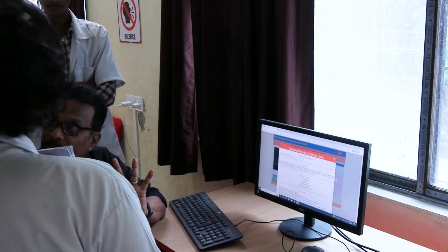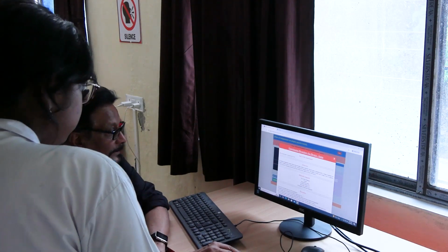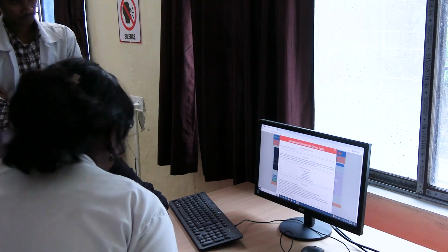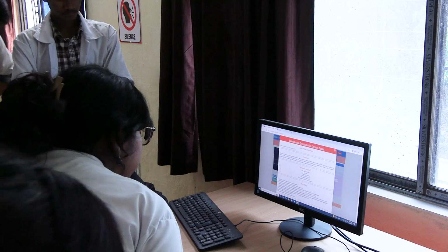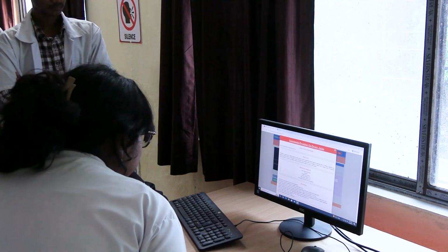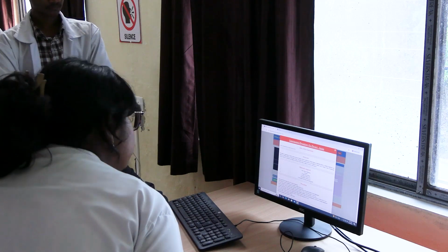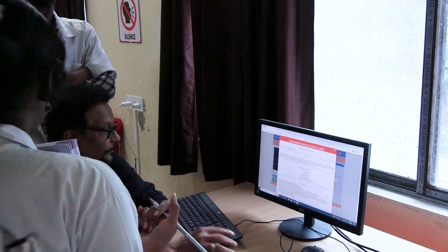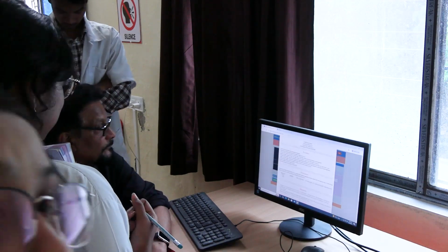Everything is explained? Okay. Then what are the requirements? Nerve muscle preparation assembly. You require cold ringer solution that is at 10 degrees centigrade. Then you require warm ringer solution that is 40 degrees centigrade and a kymograph recording device. Okay. What is the procedure?